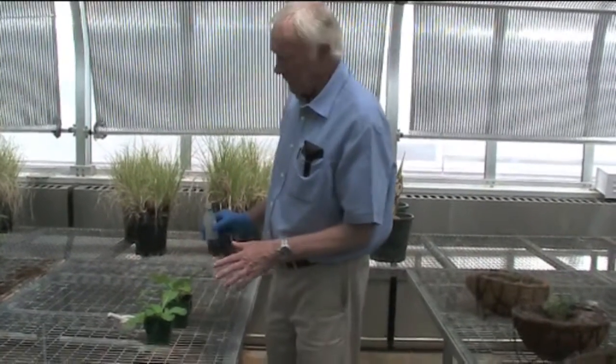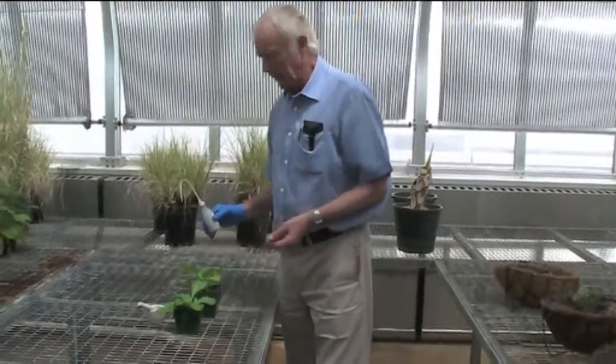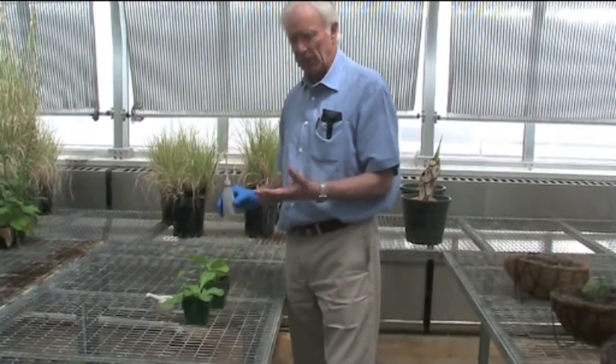We have to prepare the surface of the leaves by applying an abrasive which creates small wounds in the leaf when we apply the inoculum. This allows the virus to enter through the cell walls and come into contact with the plasma membrane of the cells.